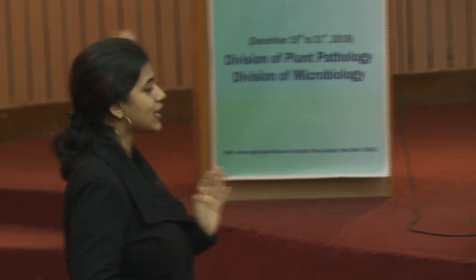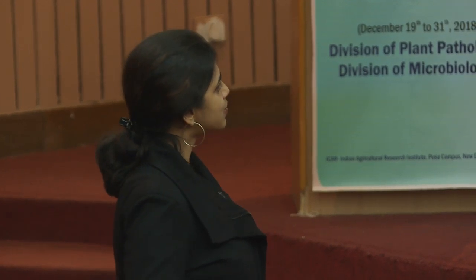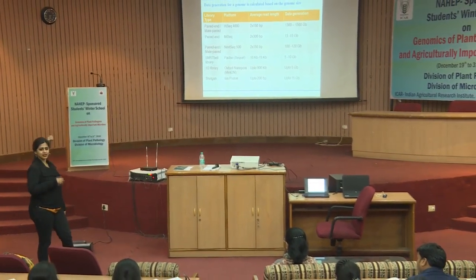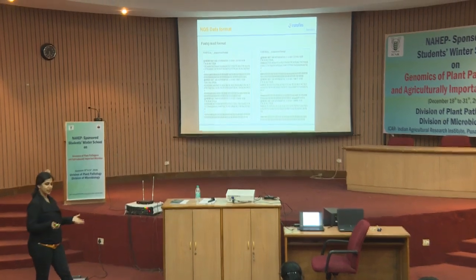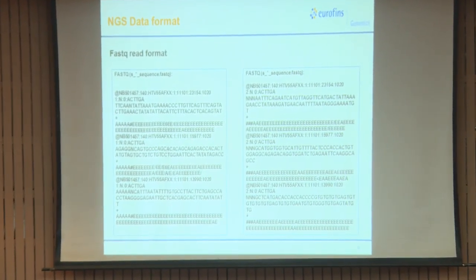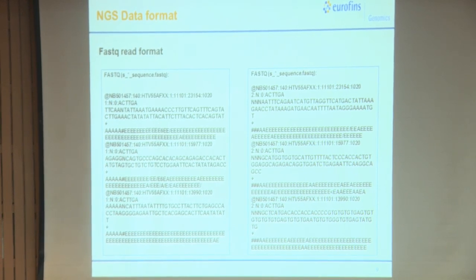So, that is how we calculate how a genome has to be sequenced, and that is when you can just imagine how many samples will go in a particular run. If I am only generating 5 GB, this is what is the run output of particular platforms. So, once we have done the sequencing, the data looks like this. We have one R1, which I said is the forward read, and we have one R2, which is the reverse read in case of paired end.